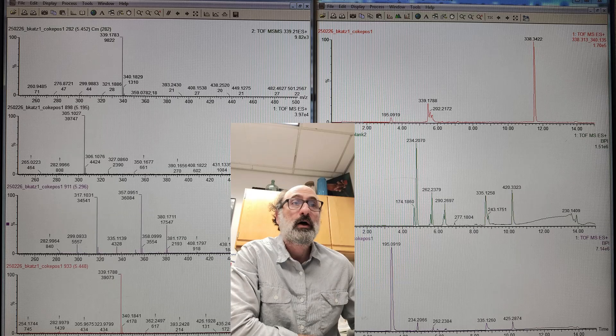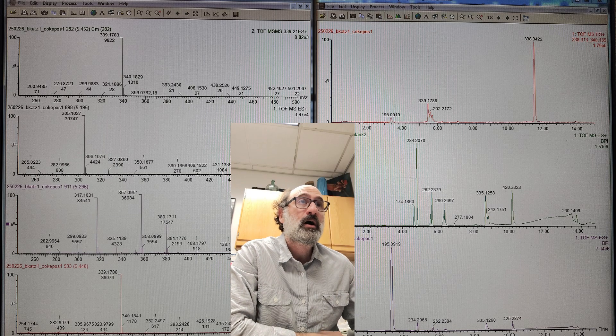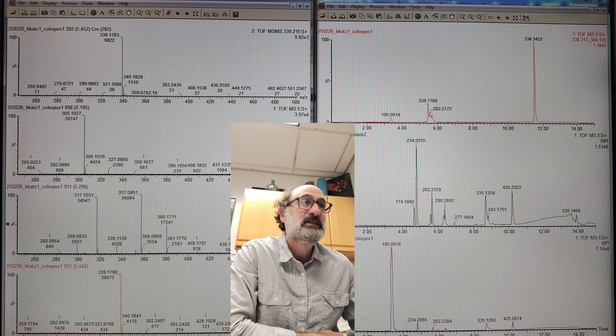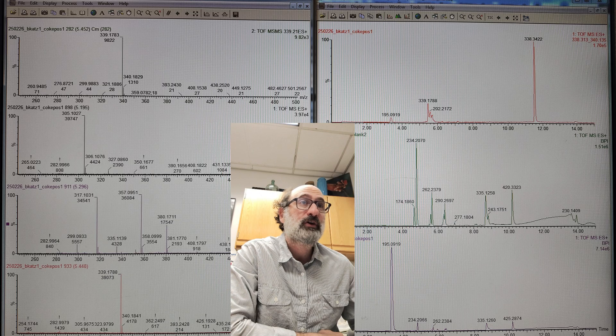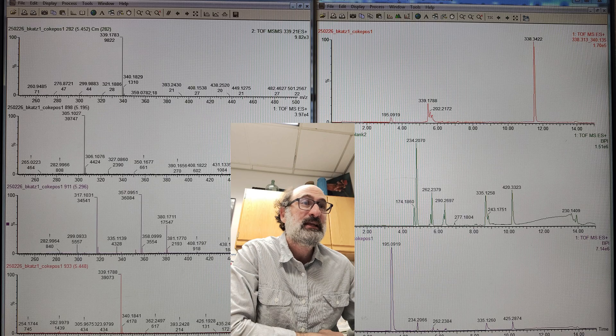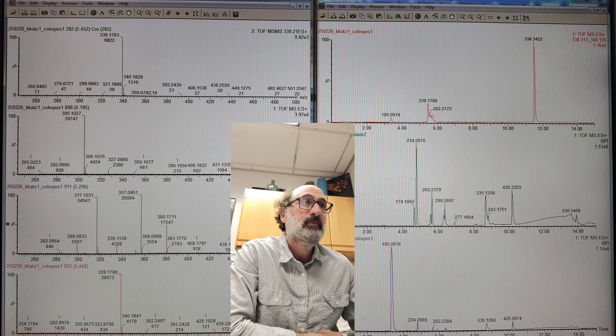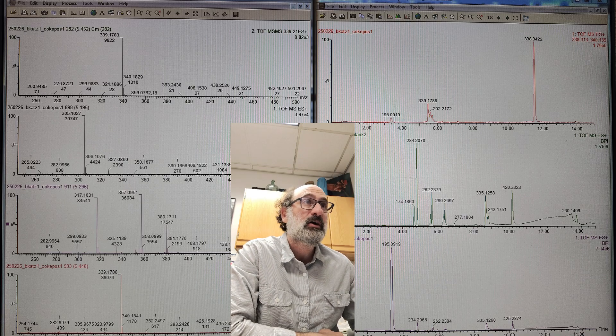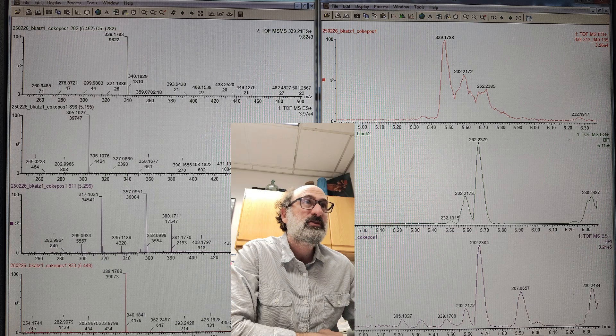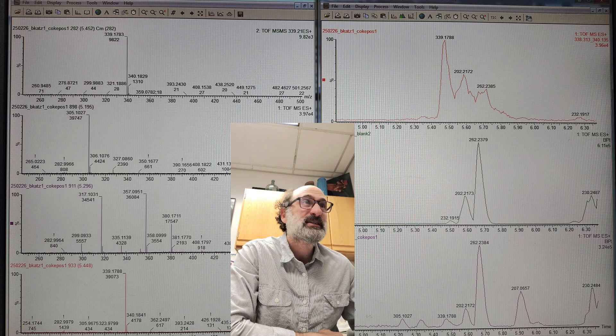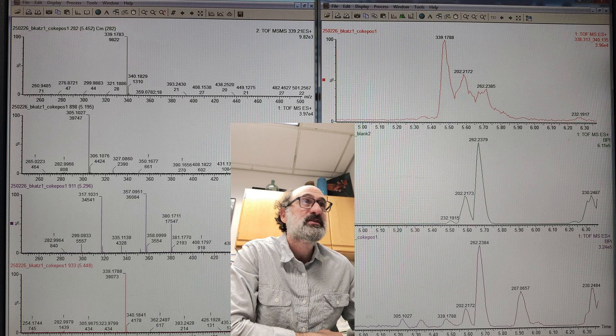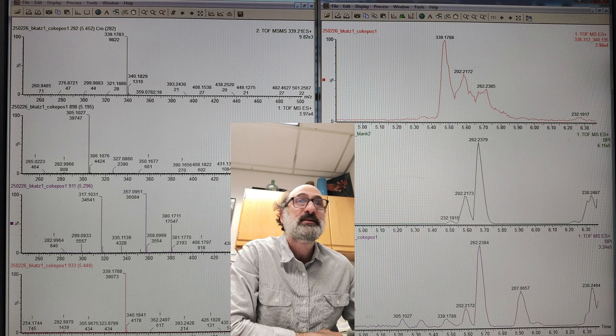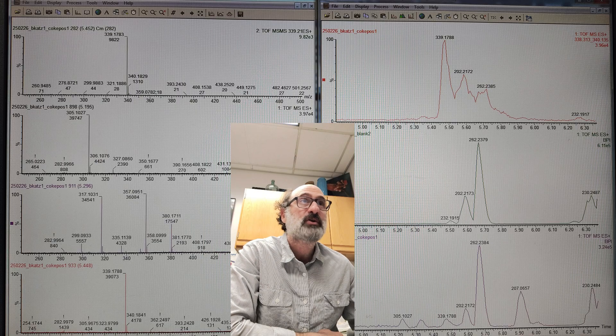Here's the LC-MS data. Bottom on the right here, that's the full TIC of the Coca-Cola. You can see all that caffeine. I have a lot of stuff in my blank - my poor C18 column is not looking good. Then you can see there's this cluster of peaks right around six minutes.